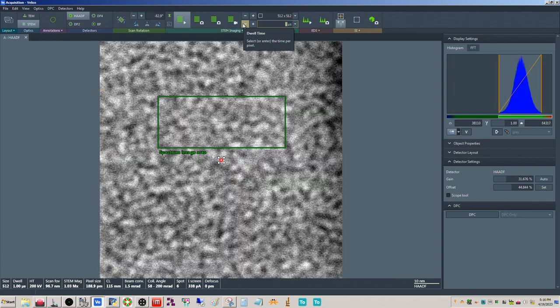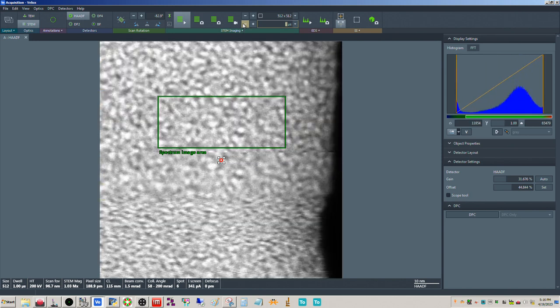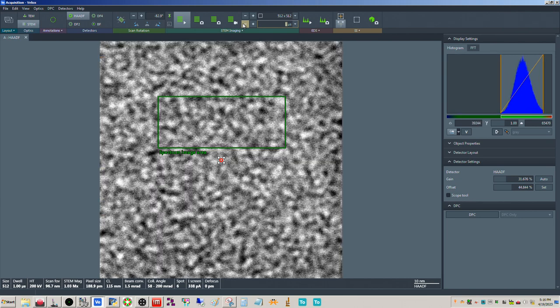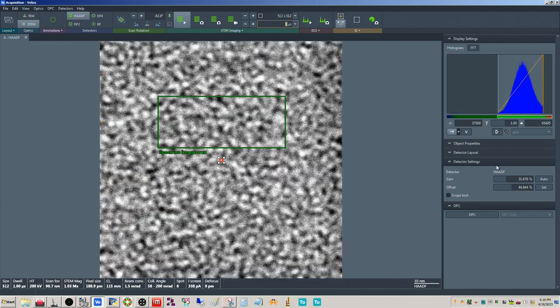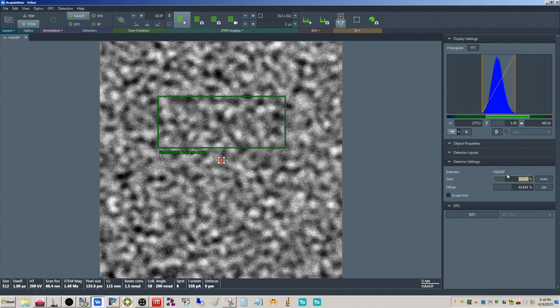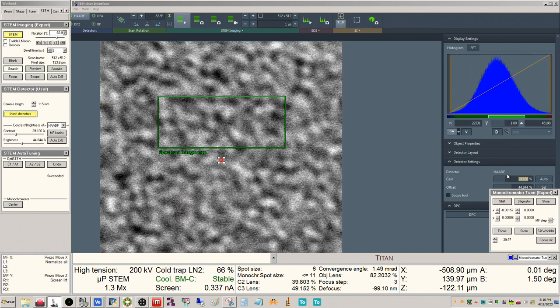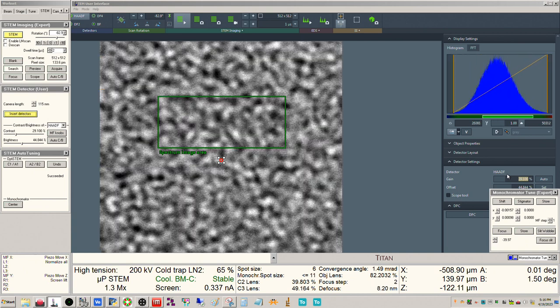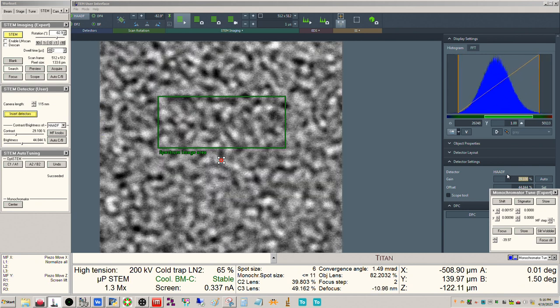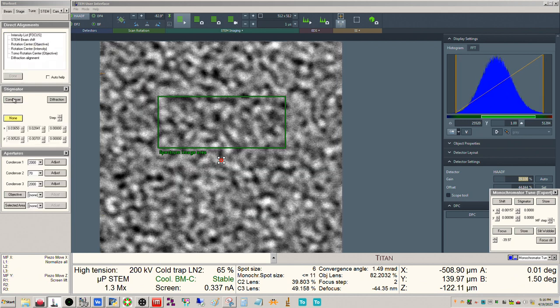Now we're not doing atomic resolution like when we're in STEM nanoprobe. What I'm doing here is focusing with the Z as best I can. STEM auto-tuning is not going to work now. So what you have to do is use your condenser, whoops, that was way too coarse, and just look at the image. That looks good. There's really nothing left to adjust, so it looks fine. If this was still off, you would go to tune and use condenser stigmator.